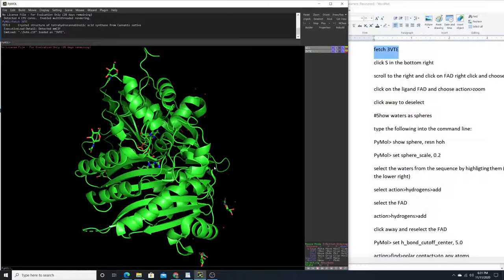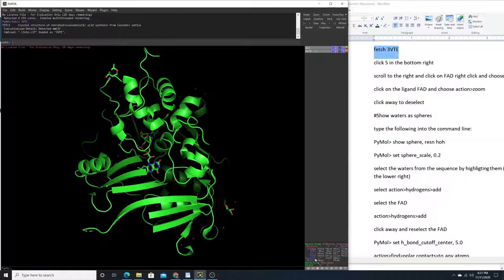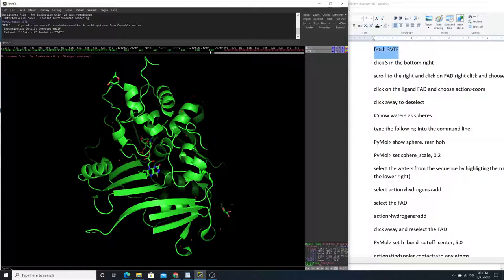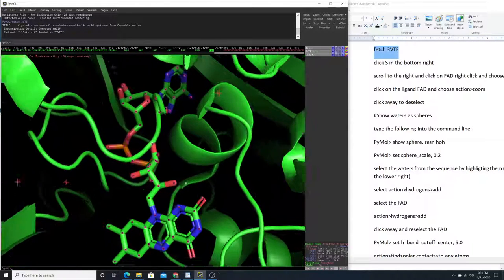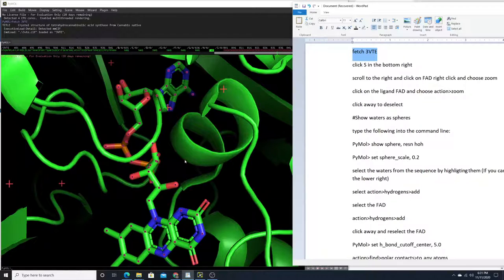We've just opened PyMOL and we can see the enzyme here — let's scroll out a little bit so we can see the ligand. If you look down at the bottom right you can see 'S', which stands for sequence. Click on that to bring up the sequence identity at the top. Scroll to the right to choose the ligand FAD, click on it, right-click, and choose Zoom.